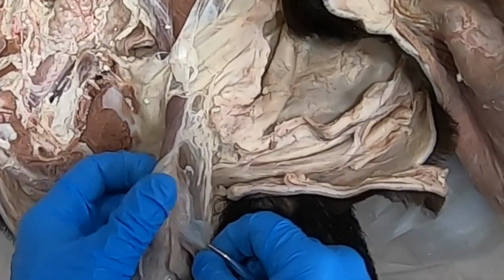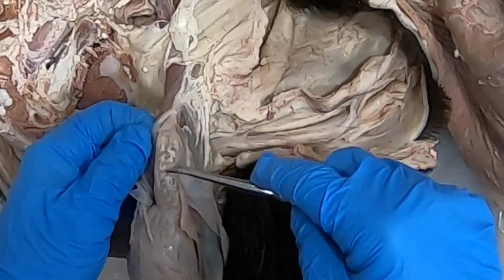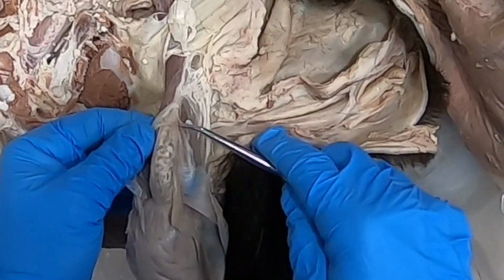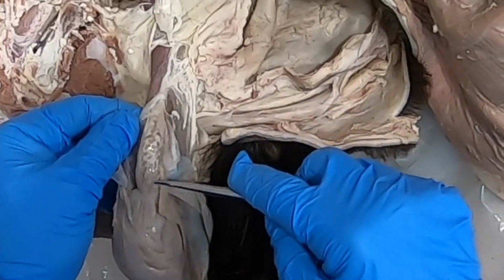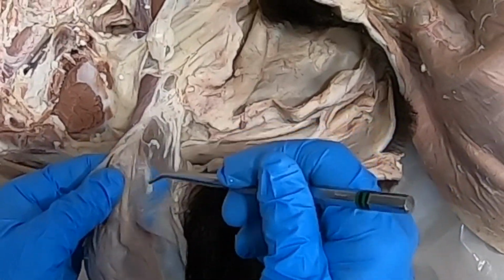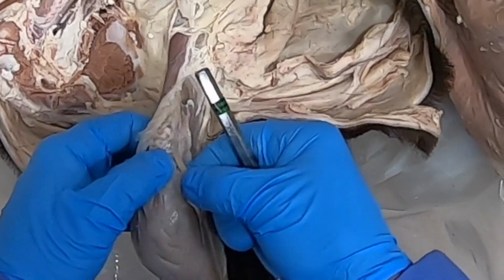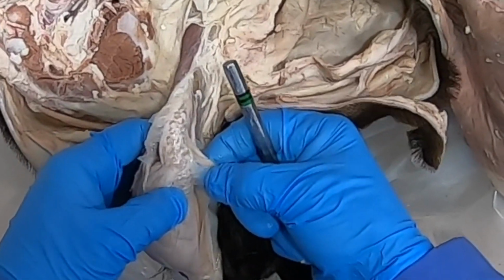So our pampiniform plexus, which is important for cooling the blood as it's going to the testes, didn't get any latex in it, but this is the pampiniform plexus here. And this is our Ductus Deferens coming down here.